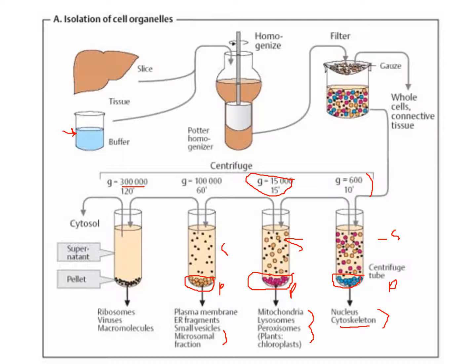We get the pellet and the soup, and we get the ribosomes, the viruses right here. So if there, how do we know? Oh, you've got hepatitis virus, infected liver. How do you know? Well, one way, you take it through this differential series, and then you have viruses that'll be detected here. And if you ran this through a FACS and you had antibodies with fluorescent tags, you could spot the viruses in this pellet and get a reading for what you have here at that point.